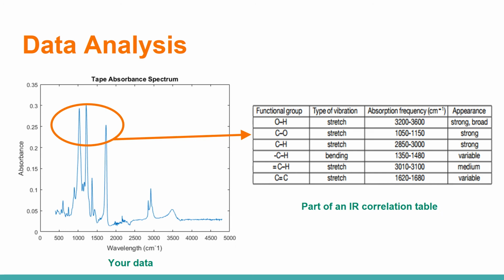In IR spectroscopy, the correlation table is used to compare your wave number and wavelength data to those of common functional groups and chemical bonds. There are many correlations out there, so you can just choose the one which best fits your needs. All the peaks are important, not just the largest ones, so make sure you do try to identify the smaller peaks as well. Once the bond types are extracted, the compound identification can begin.